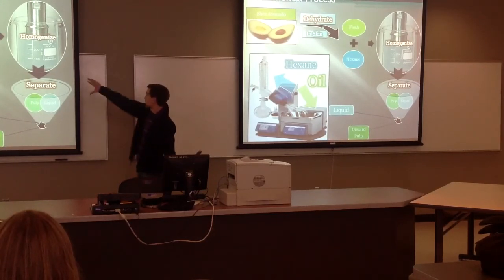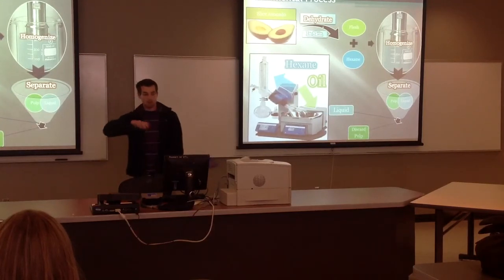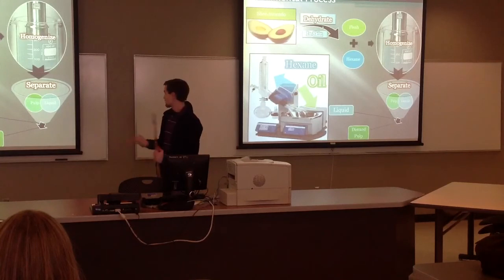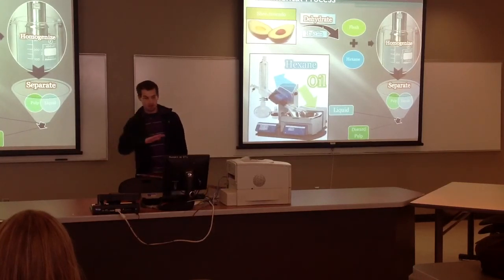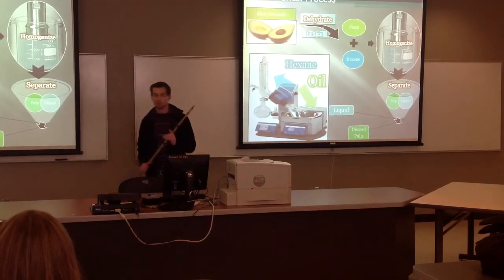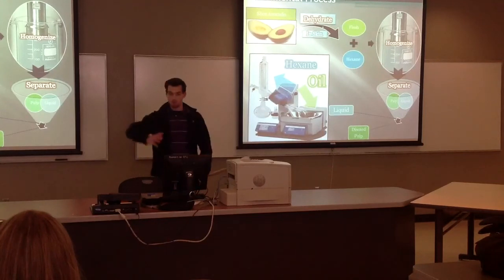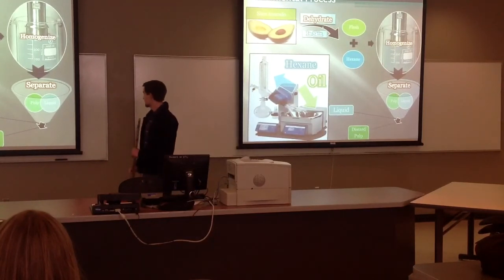So what we do with this combination is put it in a beaker and homogenize it, and you can tell after about 10-ish minutes, the solids are really small particles and they're down at the bottom, and it completely separates the solid from the liquid content. What we noticed with the non-dehydrated avocados is that water would actually blend with it too. The homogenizer was that good at blending the whole thing together, and then it was basically inseparable.